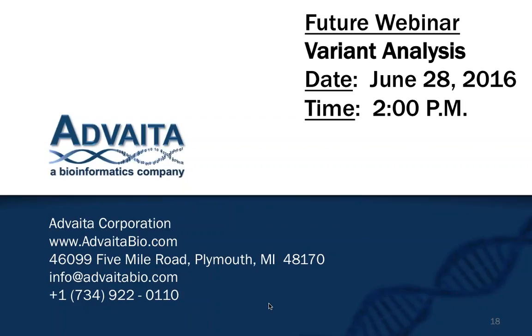Gotcha. Okay, thank you. Another question: when we talk about log fold change, are we referring to log 2 or log 10? In this webinar, I was referring to log 2 fold change. You can upload data with log 10 fold change if you would like, when you upload your file in the report intake page, but just know to choose your thresholds accordingly. We have default thresholds set for log fold change of 0.6 and a p-value of 0.05, and the log fold change of 0.6 corresponds with log 2 fold change.